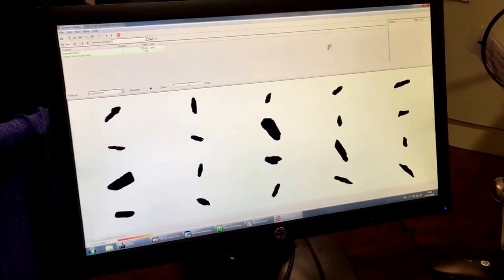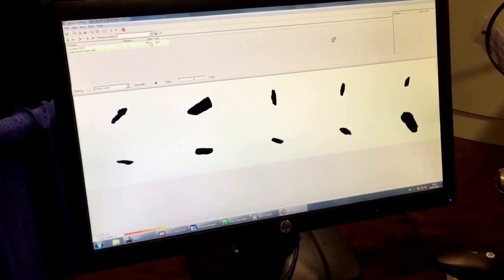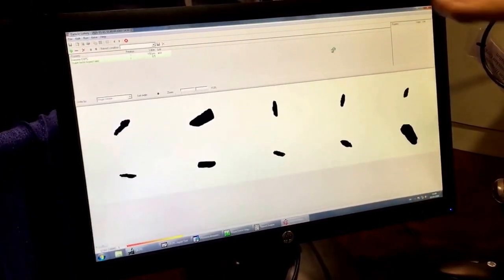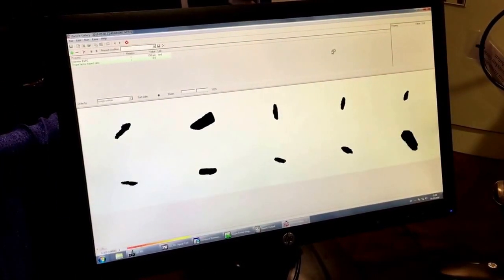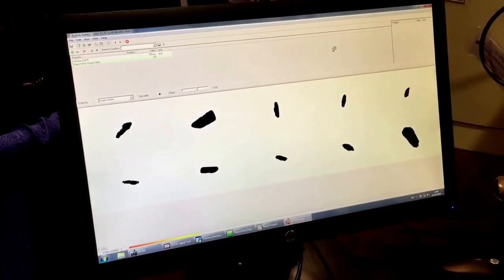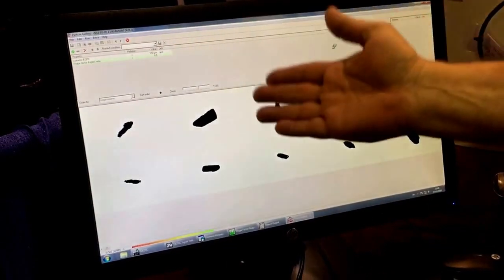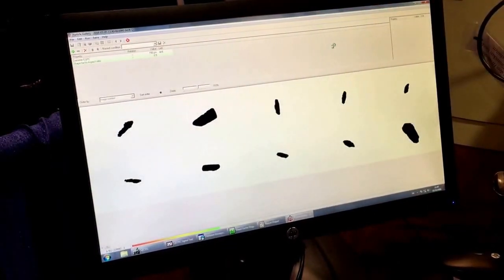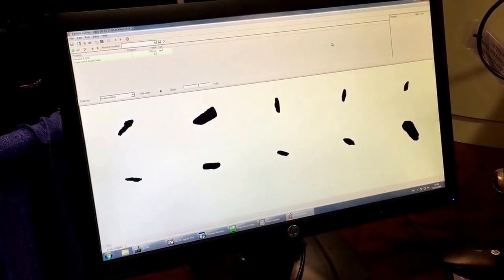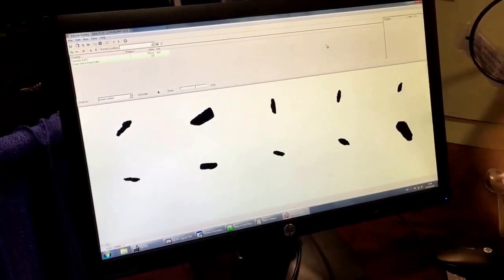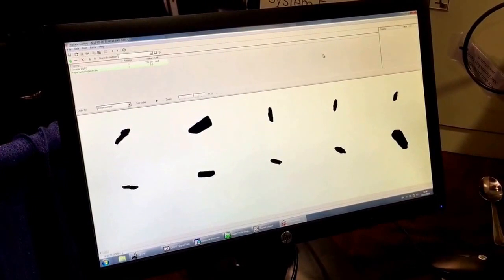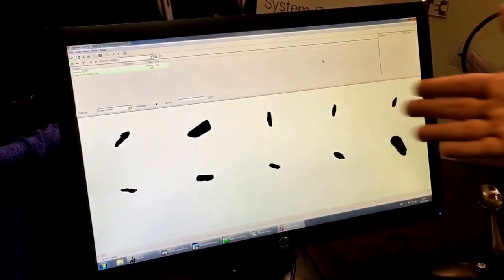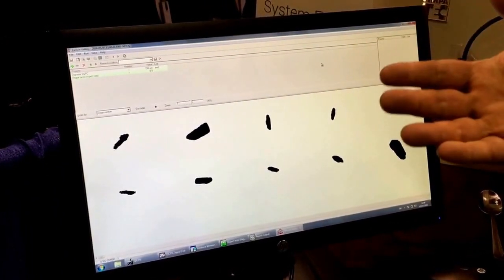So now it's going to go back through all those particles and now it's going to show me exactly those particles that fit that criteria. And one of the nice things about that then is, if I'm just interested in these particles, then I can go back and reprocess the whole data set just to get results on these guys.